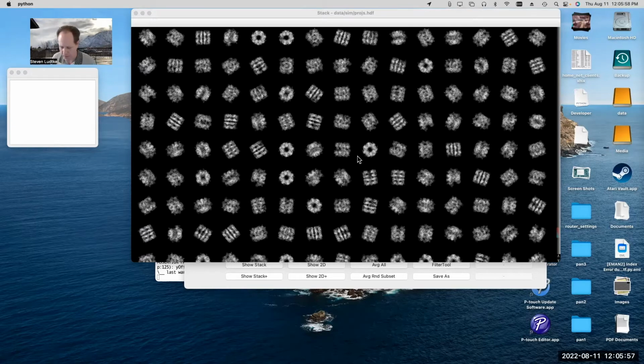So we just want to look at the dynamics analysis. We're not as interested in the refinement analysis. And it's actually fairly obvious if you look at some of these particles: this and this are not in two dissimilar orientations, but you actually see the missing subunit right there. So it's pretty visible by eye in certain orientations. You can see it there, for example, too. So I certainly hope our dynamics analysis tool will be able to easily detect that. The subunit which is moving a little bit may be easier or more challenging to find. We'll have to see how it goes.